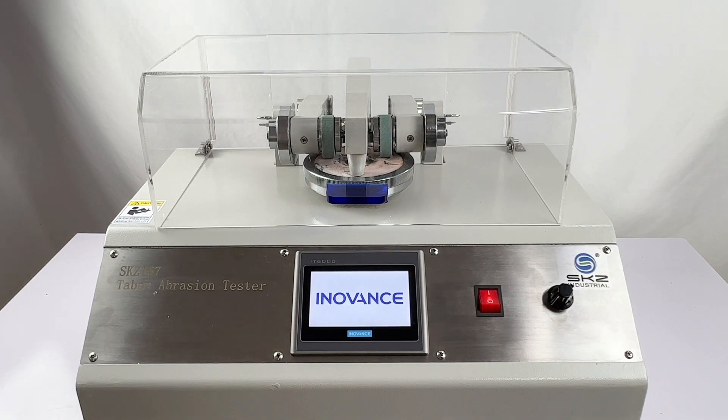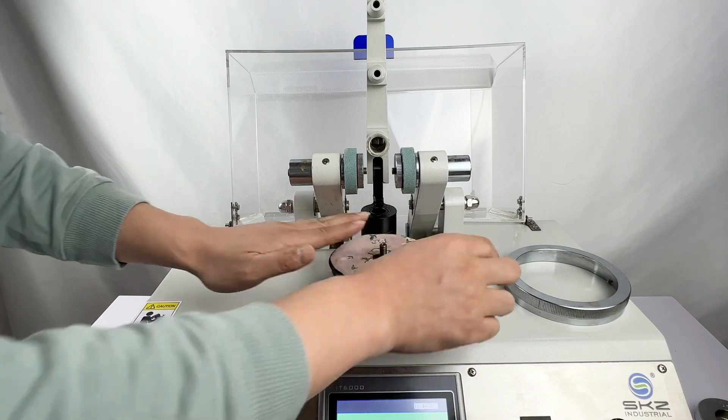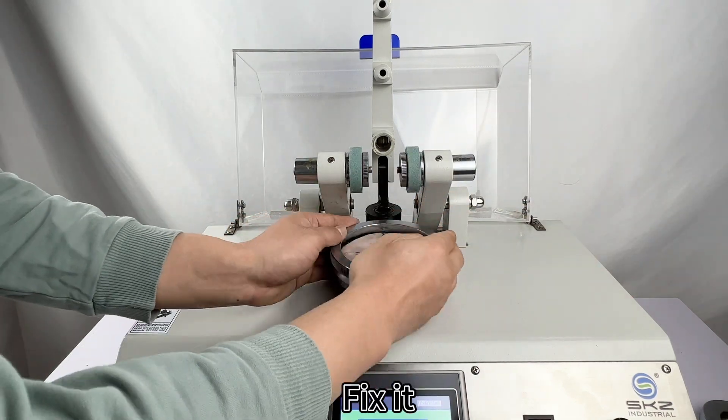SKZ 167 Tabor Abrasion Test repair sample. Put abrasive paper and sample, then fix it.